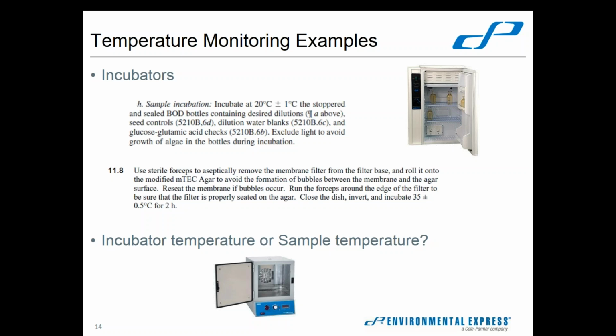Your microbiology sample, with your filter in it there, or possibly the sample bottle if you're using some of the liquid incubation methods. You're counting on the air inside the oven or incubator to be at the proper temperature, and then bring the object that you have put inside there up to that temperature as well.